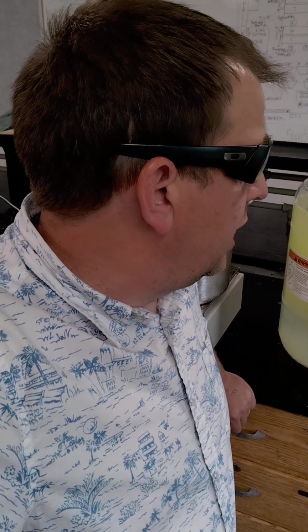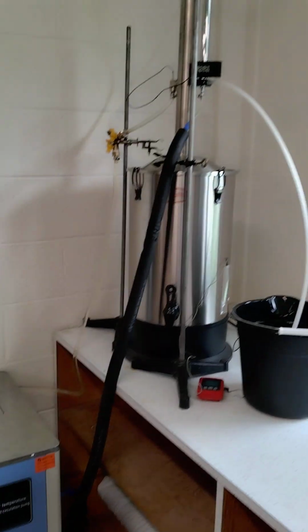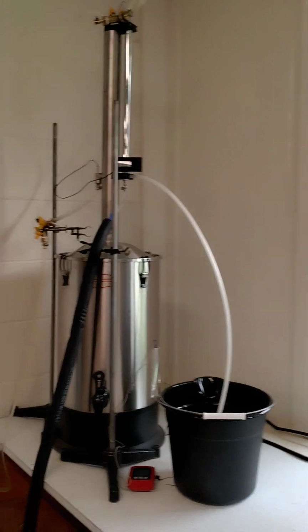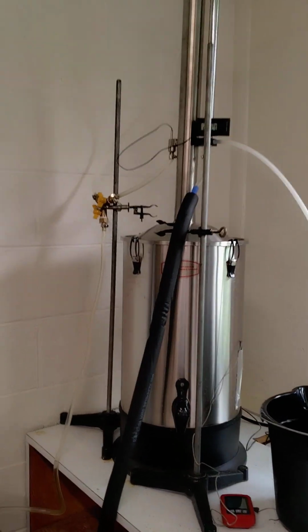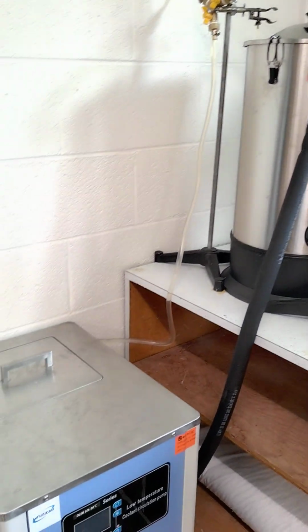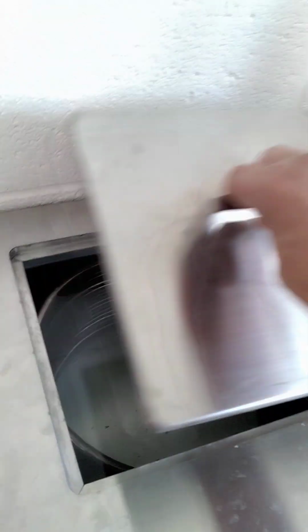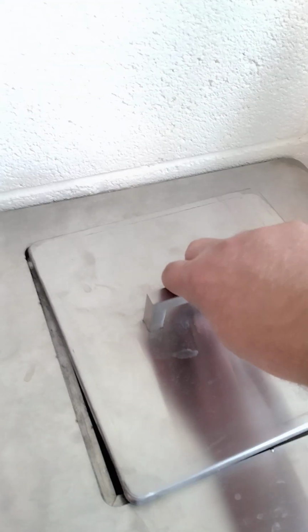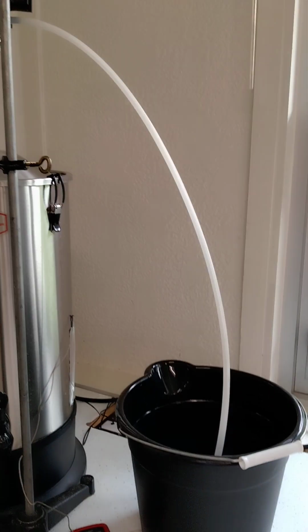With our program, we do have some other pieces of machinery, and this is stuff that our wonderful science teacher has procured for us. That is our distillation unit there. With that, we have water piping that does run down to our chiller. This is a chiller that is full of ethylene glycol, so that's not water down there, that's ethylene glycol. This unit will keep that liquid at a constant temperature, and it'll circulate it up into our distillation chamber and then back down, and then our alcohol will come off here into our collection vessel.